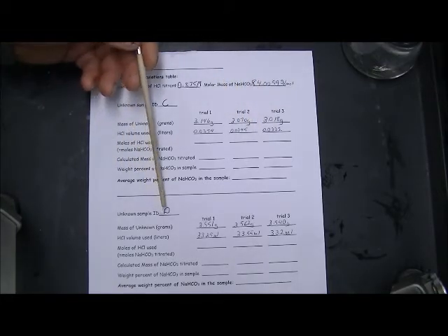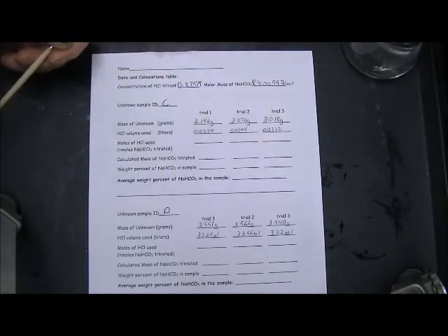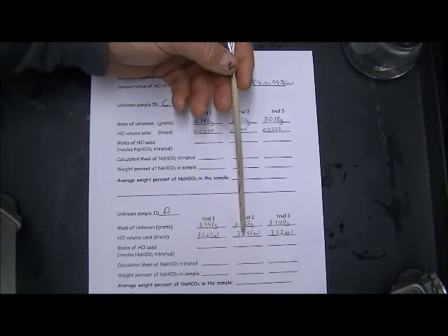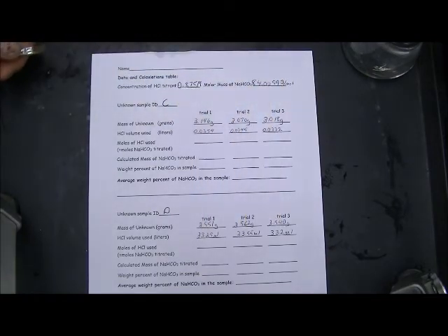And for sample D, there are the masses. I wrote down the volumes in milliliters, so those will have to be converted to liters before you do your calculations. It's a simple move of the decimal point. It shouldn't be a problem.